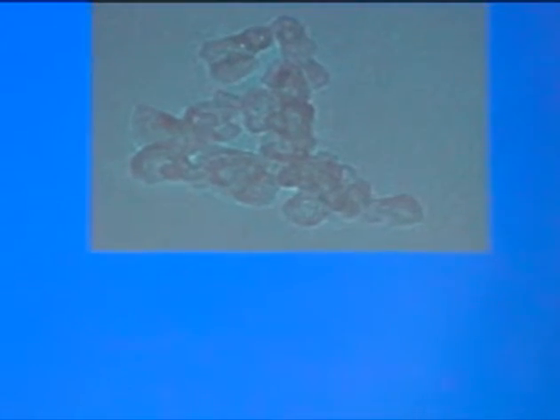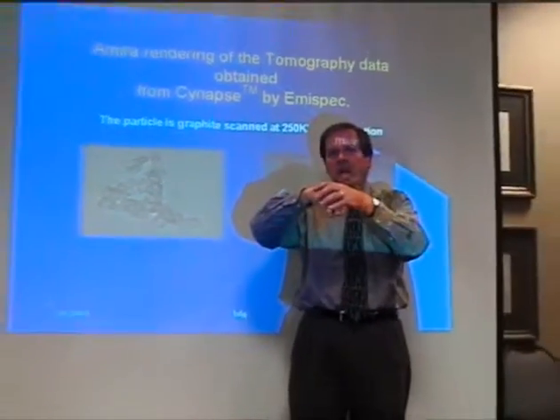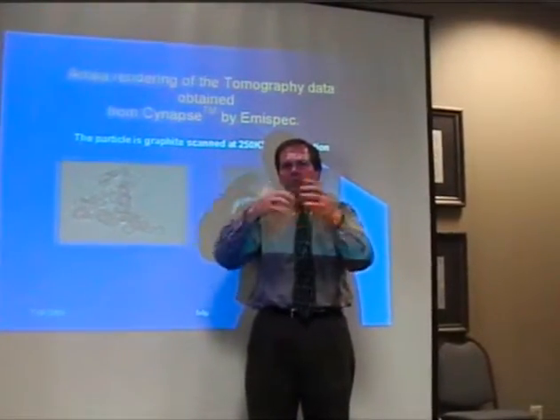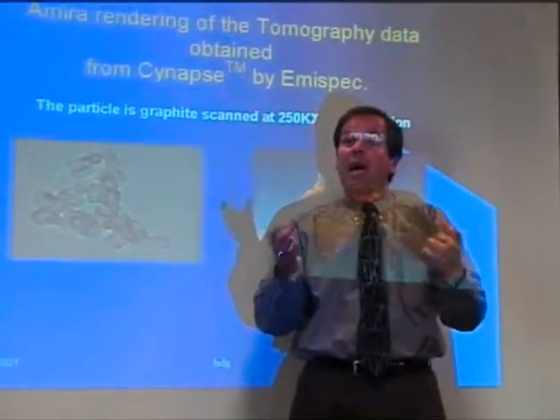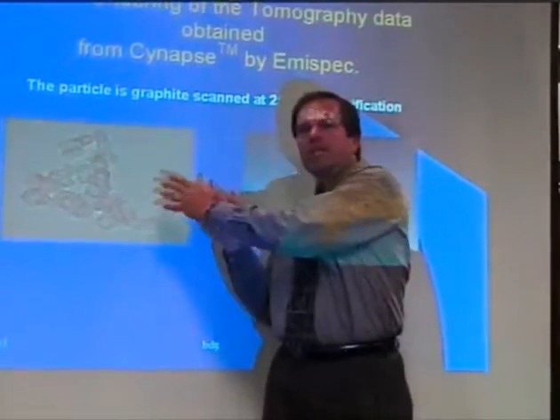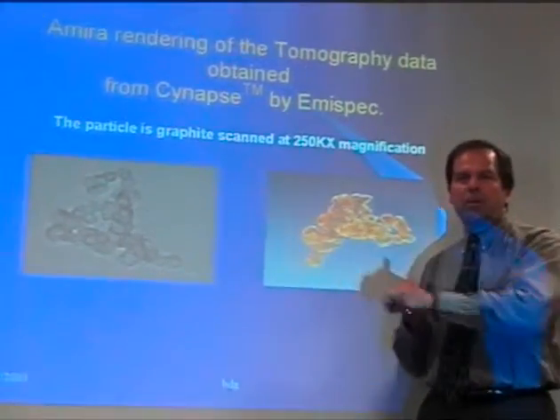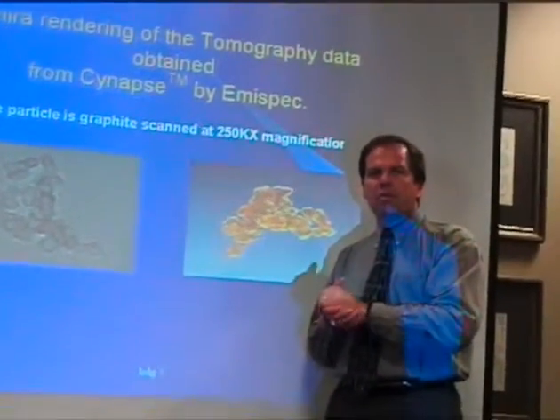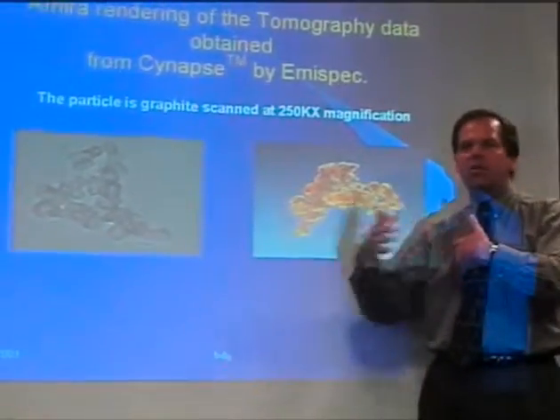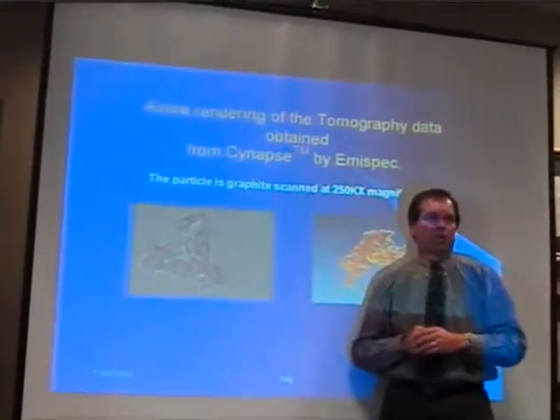Then you need software which will take those slice images and spline surfaces, okay? Give you a 3D splining surface, which can then be put into a build file that builds the solid. Building the solid from splines is done for MRI and CAT scan images right now. So all we did was to take that software with these images and build the model that you saw. So the back end of this, the building, is all known technology. We just happen to do it with new files. These files were generated by the software in the instrument.